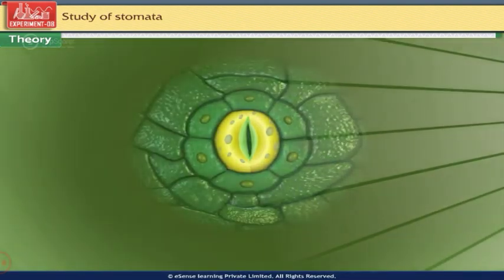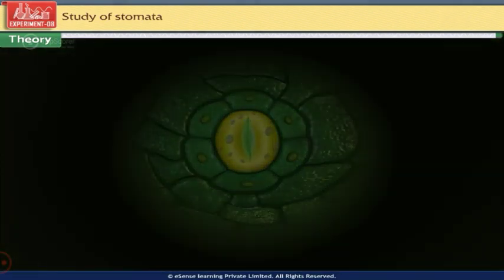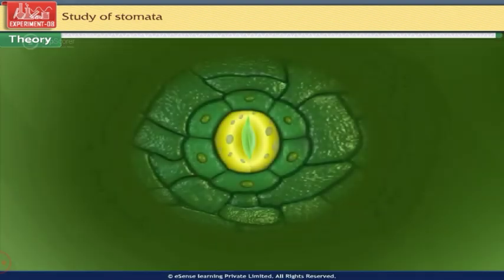Stomata get widely opened after exposing to sunlight and are found to be closed in darkness. Stomata regulate the exchange of gases and water vapor between the atmosphere and leaves.